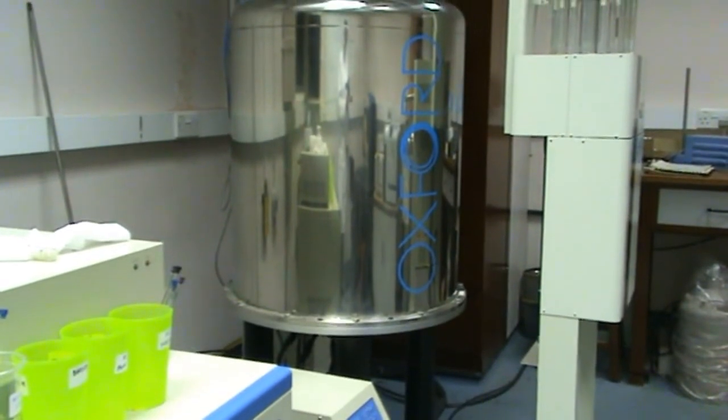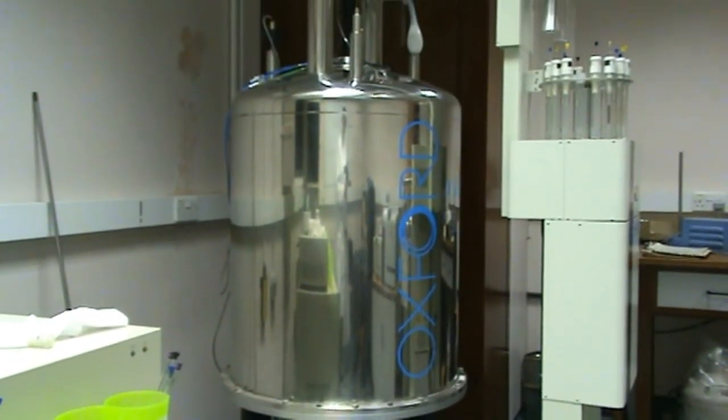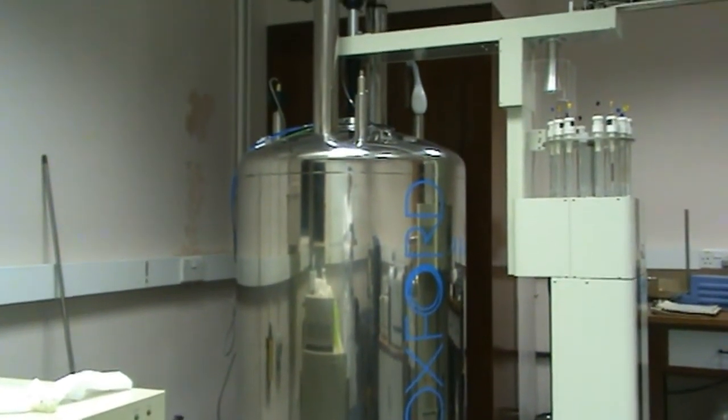Hello, today I'm going to show you how to run an NMR spectrum. The sample has been prepared in the lab as shown in the previous videos. No solvents or reagents besides your sample can be brought into the NMR lab.